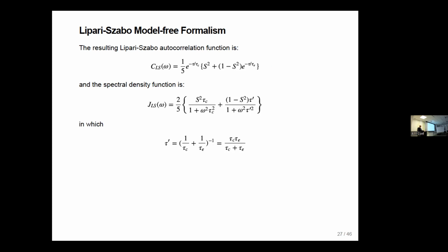relaxation. And if you run a 2 microsecond MD simulation and calculate the order parameters over it, you tend to find order parameters that are lower than the NMR measurements, because even in 2 microseconds, you start sampling motions that are slower than tumbling and don't contribute to the NMR result.